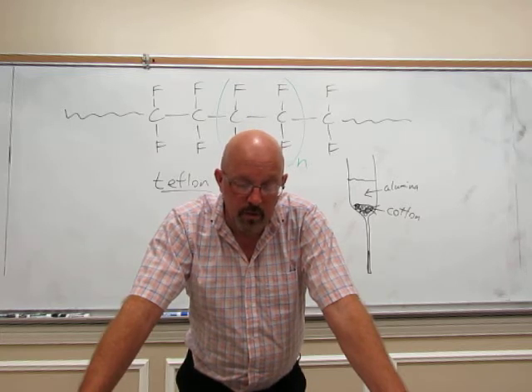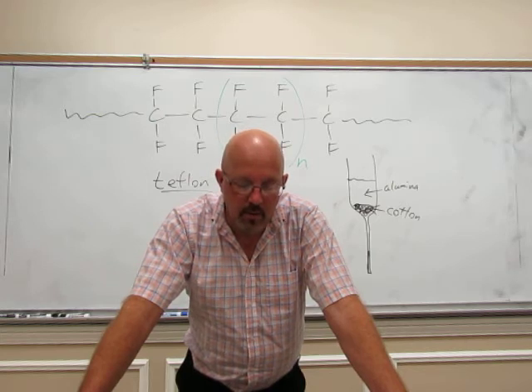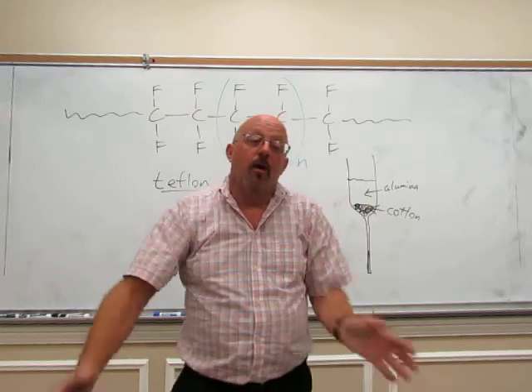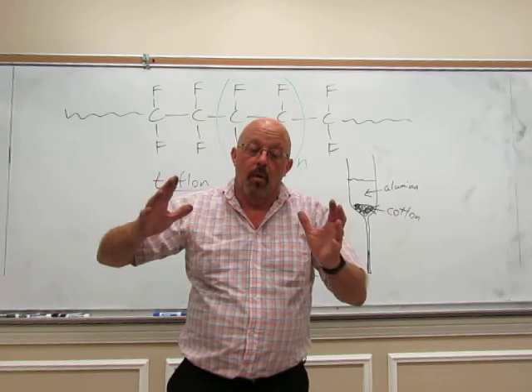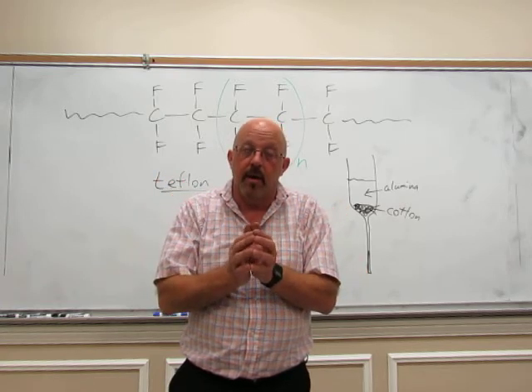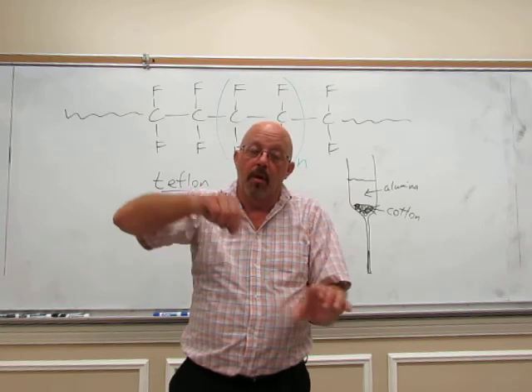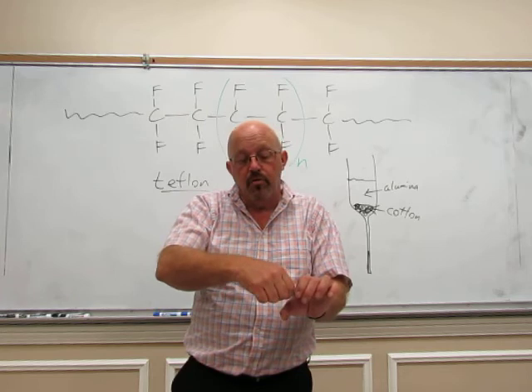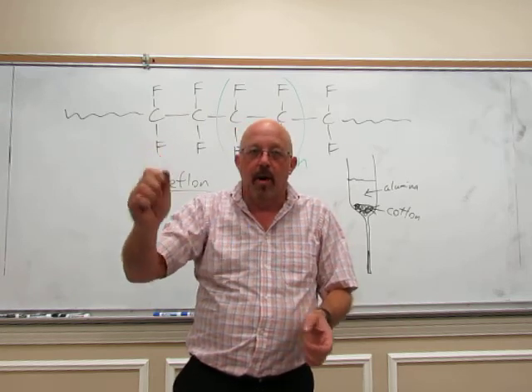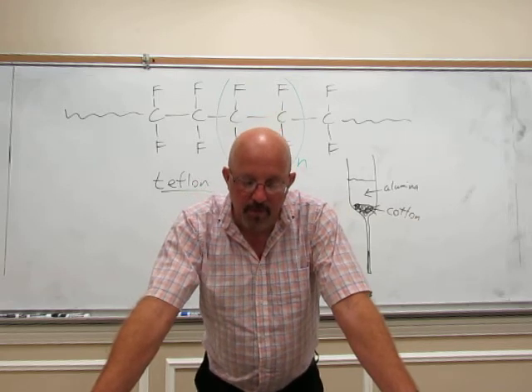So once you think it's finished, pull it out, let it cool, and then you're going to put it in an ice bath, and hopefully it will shrink down. Now leave the boiling stick in there, and we're hoping that the polymer will shrink down, and that you can then pull the polymer out using the stick. It should shrink onto the stick, and you should be able to pull it out like a lollipop. It'll look like a lollipop if it works well.